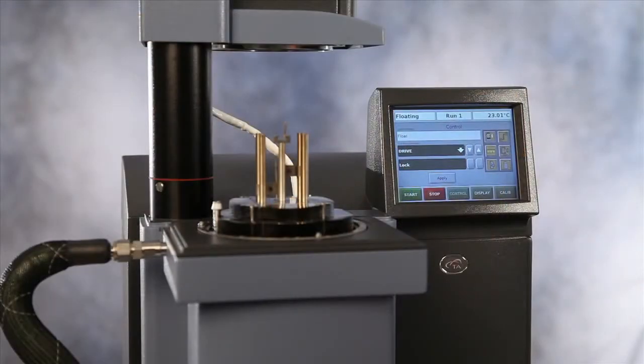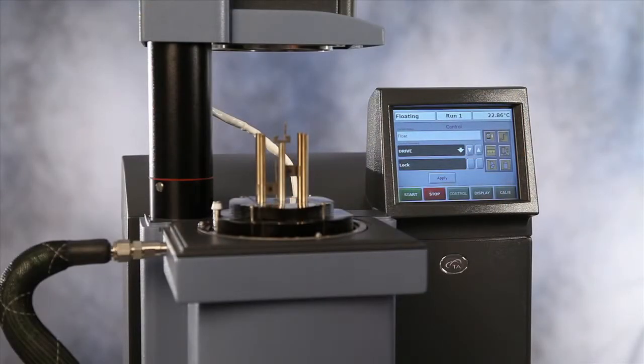This TA Tech Tip is going to show you how to calibrate the Q800 fiber clamp. Before calibration, we shall first install the clamp to the instrument.